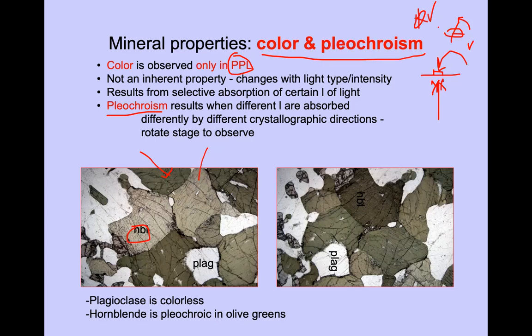Sometimes this color might be entirely different from the original color. I mean, this green might be changing to purple. There are such situations also. That all depends on the mineral property. That's why it is regarded as a special feature for that particular mineral to identify.